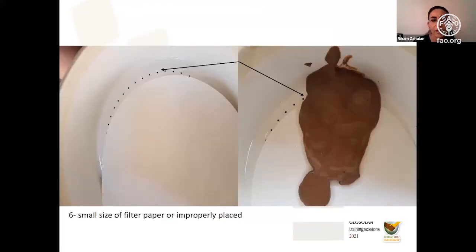This is a very common mistake, actually, because that's why we said we need to choose the right size and type of the filter paper. As Dr. Manhal mentioned, it should be 42 or 45, yes. We need to make sure that we place it in a proper way so we can cover all the holes of the Buchner funnel. As we said, we use it as a barrier to prevent soil from going down to the soil extract. So it's a very common mistake, and the result will be like this.